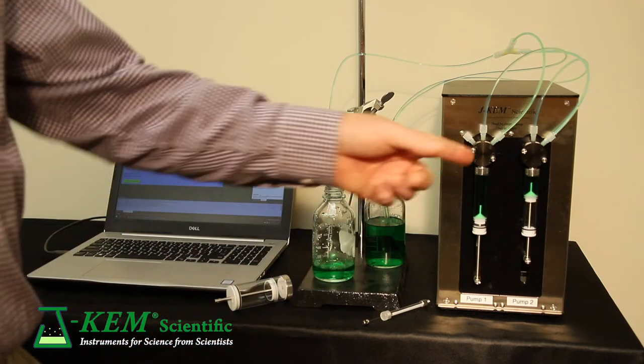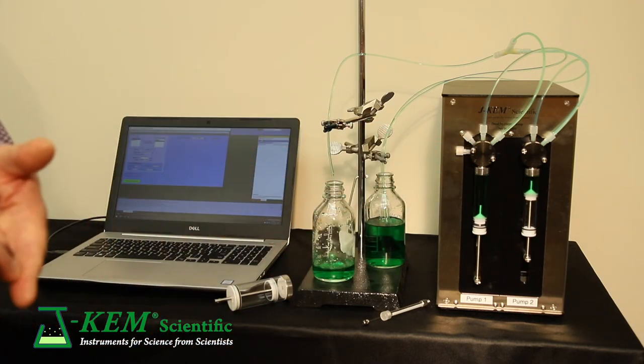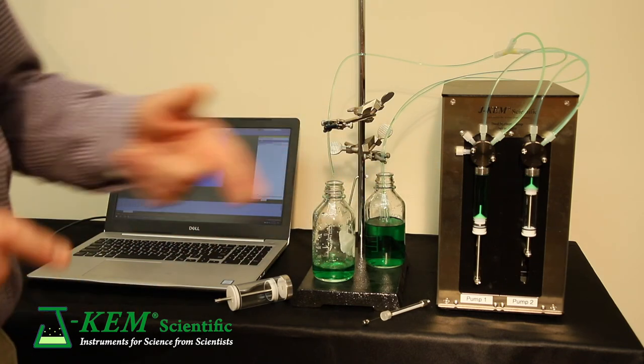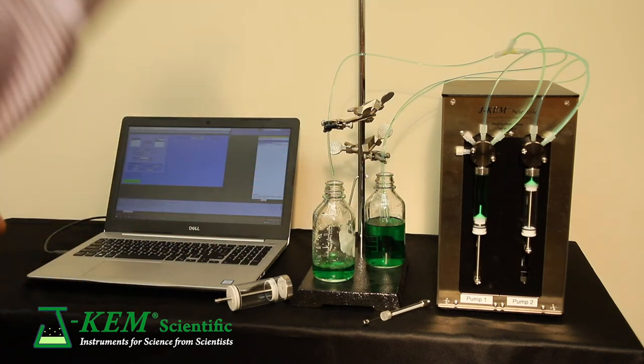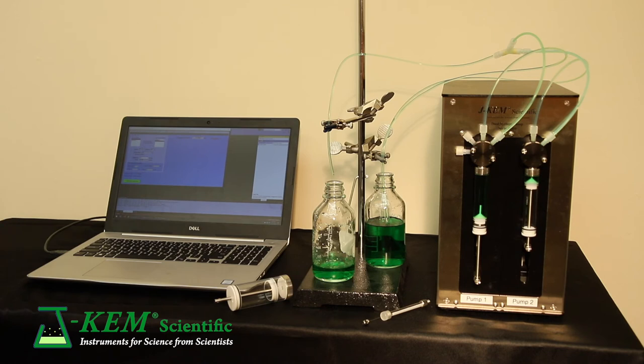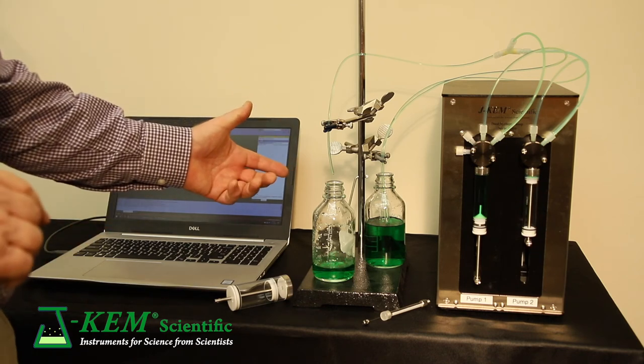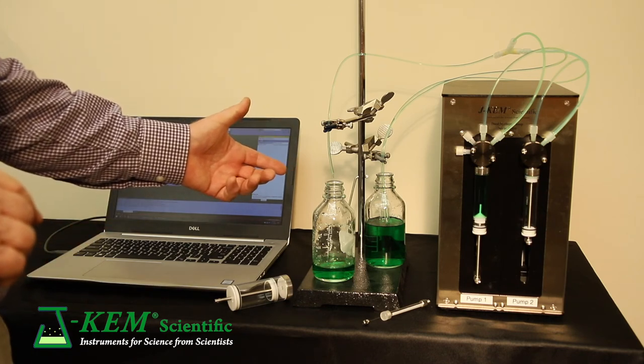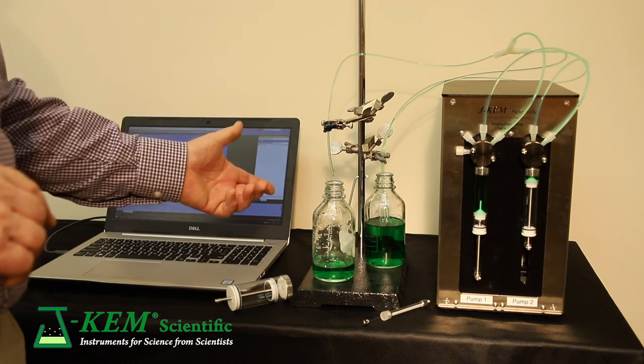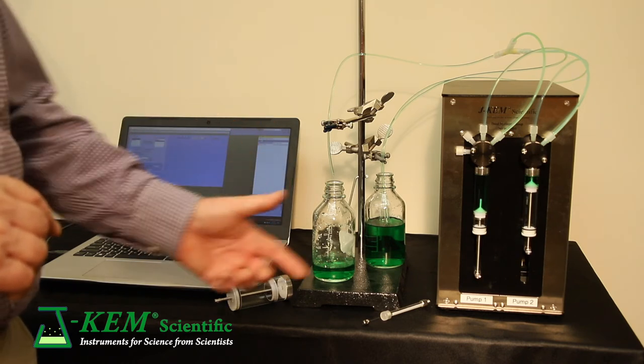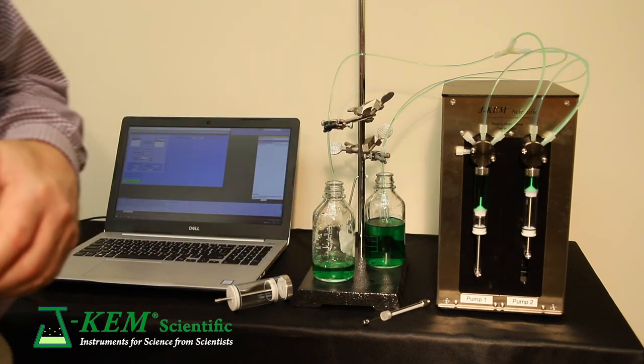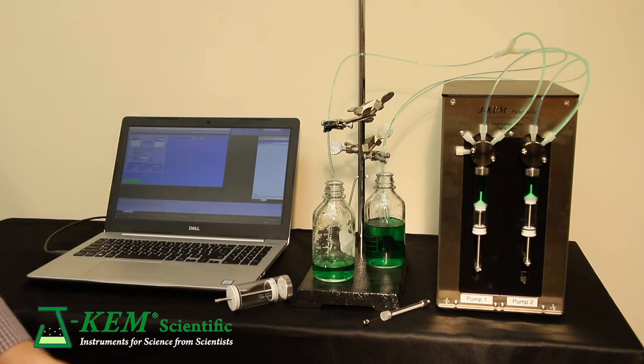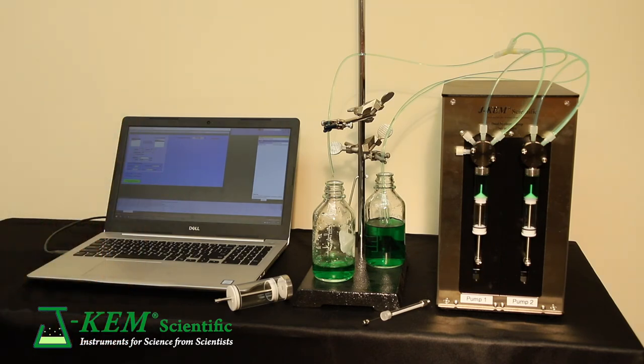And then while syringe two is delivering, syringe one refills. And in this case, as soon as syringe two is empty, you'll see there's no break in delivery. Syringe one starts to deliver. And this reciprocating syringe action can continue for as long as you need.